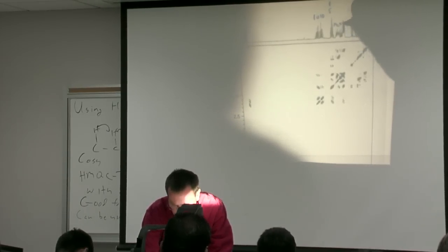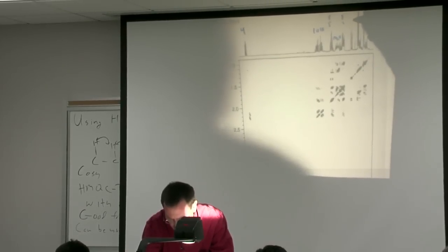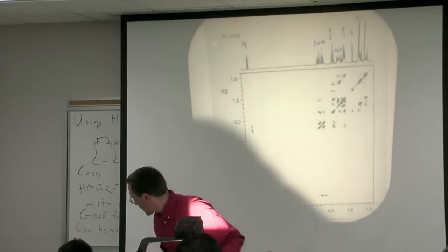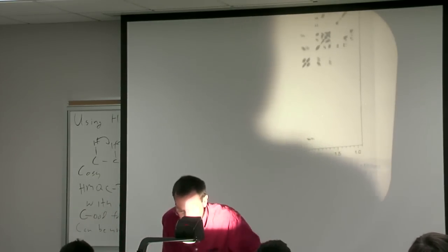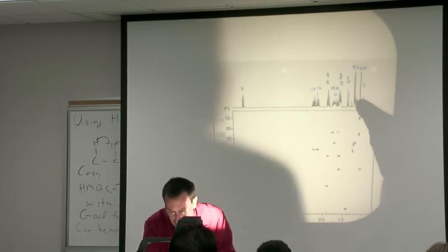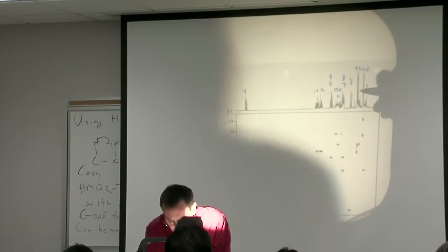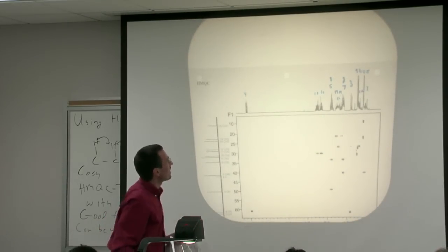14, 12, 14, 8 and 7 heaped on top of each other. 3, 9, 11, did I remember to do? Oops, it looks like on the previous one, there's one more little guy I missed here. So let me bounce back for a second. Looks like I missed that little guy over here, which is 12. Okay, yeah, right off of 12 here. So we've got 12, so we've got another diastereotopic methylene.